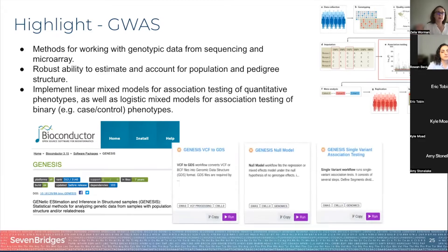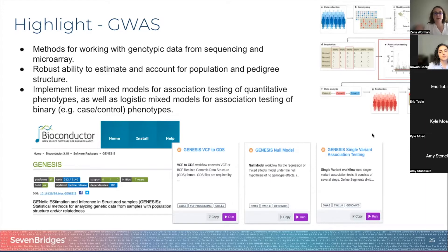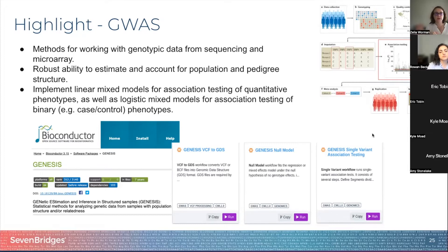Rowan will now show you how to use these tools. As I mentioned, you don't need to do a lot of coding to run GWAS, because the Seven Bridges team has collaborated with the TOPMed University of Washington DCC to create these tools and make them into point-and-click workflows in our platform, turning this R package into a workflow you can use in our platform.